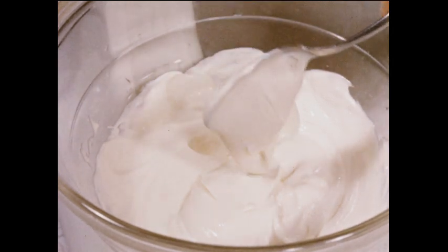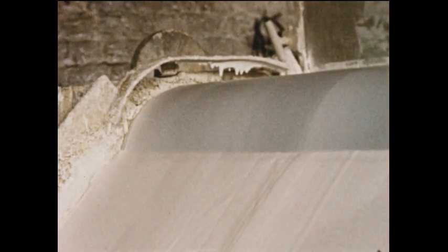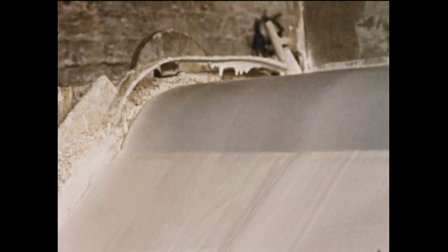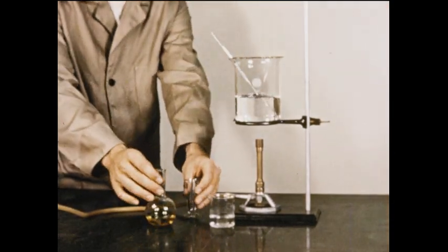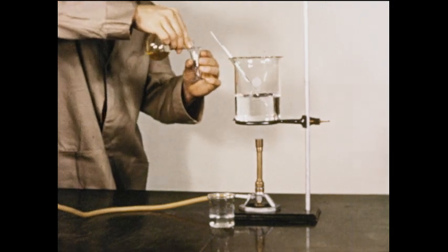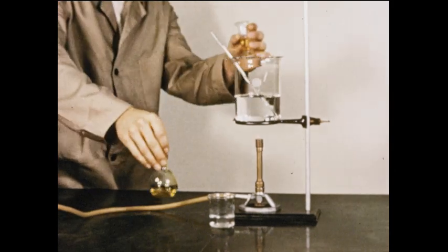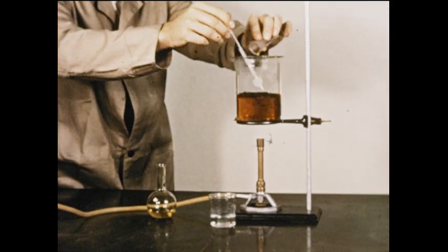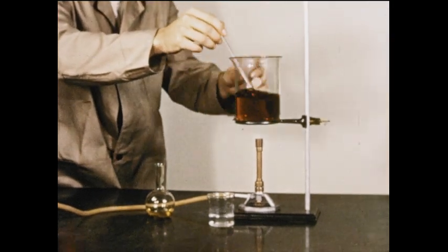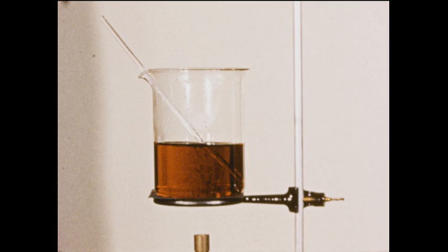Just as we can prepare colloidal dispersions by grinding matter down to extremely fine size, we can make colloidal particles in a second way. Instead of breaking down particles, we can also build them up. In a solution, we can coagulate or build up molecular-sized particles to larger colloidal-sized particles. When we add ferric chloride to boiling water, for instance, we get reddish hydrated ferric oxide. This colloidal dispersion was made chemically by combining molecular-sized particles to form the larger colloidal-sized particles.